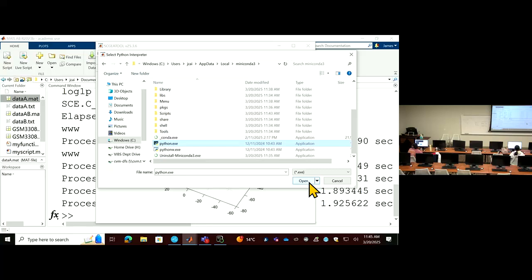It's okay, it'll be fine for the Python part. We are going to use a smaller example to do this, because the large one is too big. We are not going to use the data set with a large number of skin cells. We will use a small example to run this because the data is too big for this 20 minutes. Okay, so now we just set up this. Yeah, we're ready. Good. Any question? You don't know where to find Python, no problem.